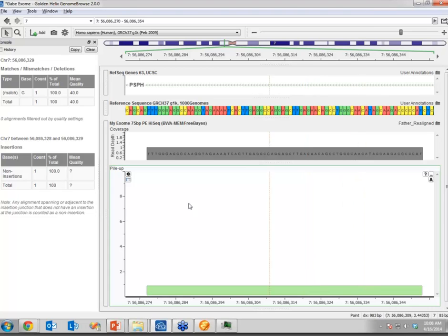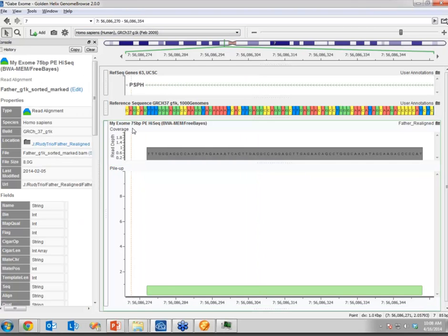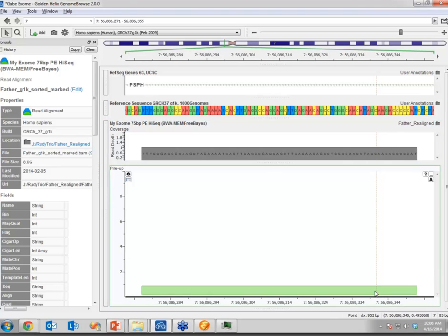What we're looking at is alignment, right? This is a single alignment of a single read onto the reference sequence of the human reference. It happens to fall in the intron of a gene that is based on data coming out of my exome, extracted from my blood and sent to 23andMe, or actually, sorry, my saliva. So this alignment is very, very simple bioinformatically, and in fact, if all of them looked like this, we wouldn't be talking today because it would be just a done deal.